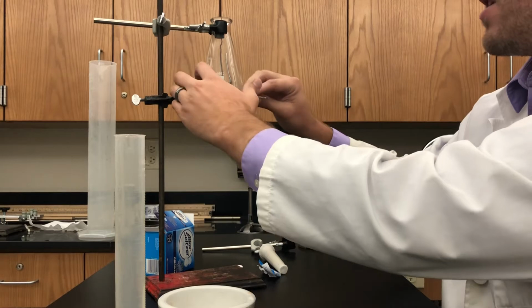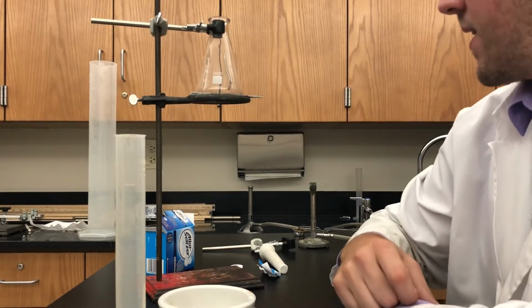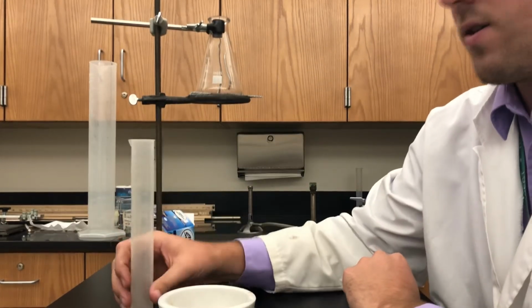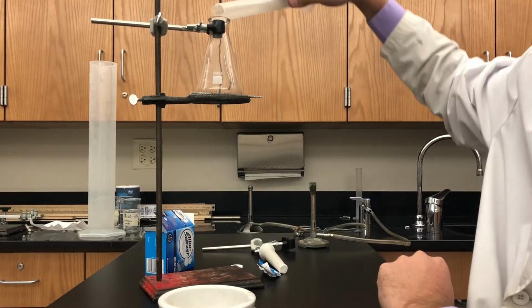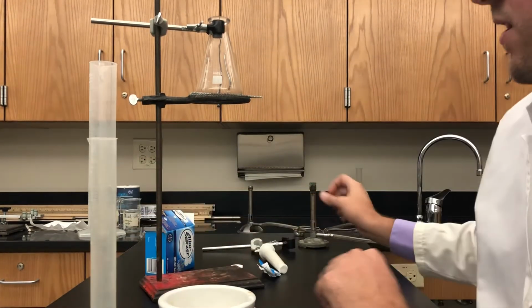So you've got your Erlenmeyer flask in there. You'll use your graduated cylinder to measure out a certain amount of water. Add the water to your Erlenmeyer flask, and then you light your Bunsen burner.